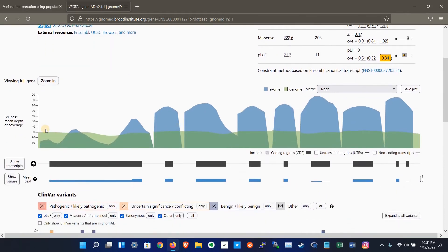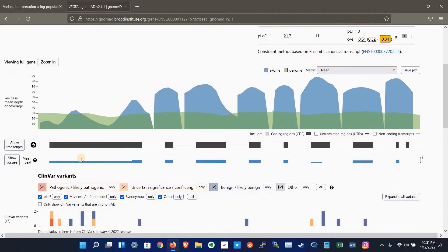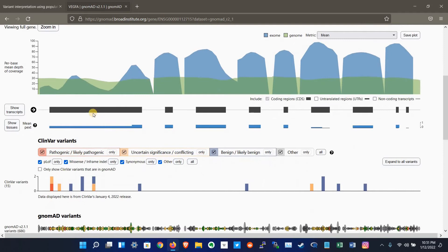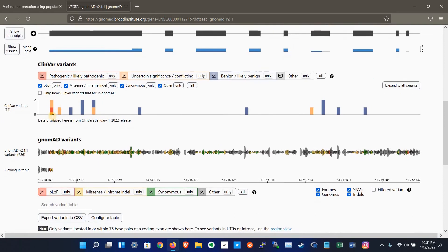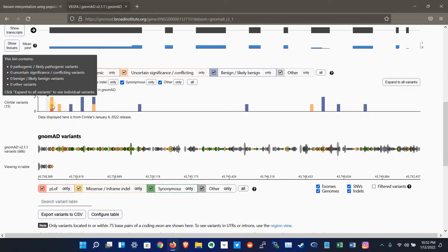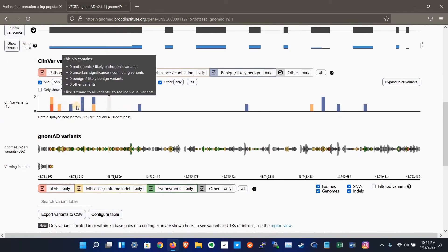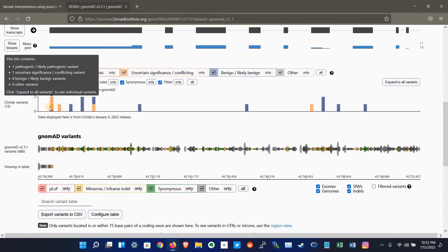This shows the mean depth of coverage per base, and this shows the transcripts. This is the coding region and those are non-coding regions. This shows the tissues, and this is the results of ClinVar on that region. They have some variants which are also reported on ClinVar.